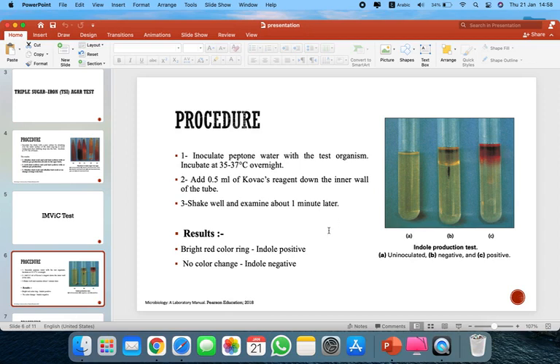that consume protein instead of carbohydrates. So these bacteria, as I said, are able to break down the amino acid tryptophan into indole. This test detects the ability of the organisms to split indole from the amino acid. So what will happen? If it has consumed the amino acid, it will split the indole. The indole is then detected by a reagent called Kovac reagent.